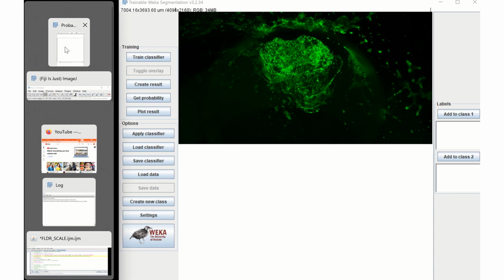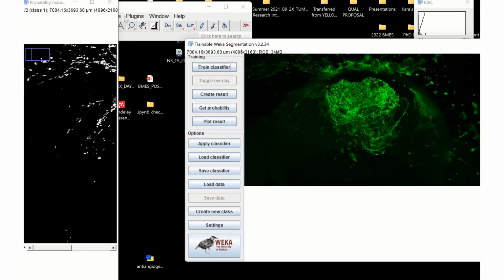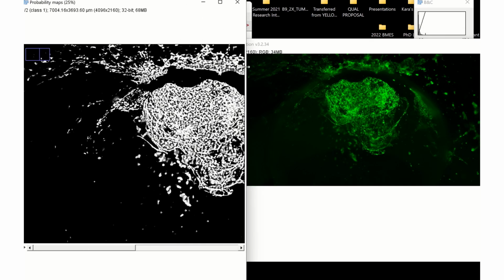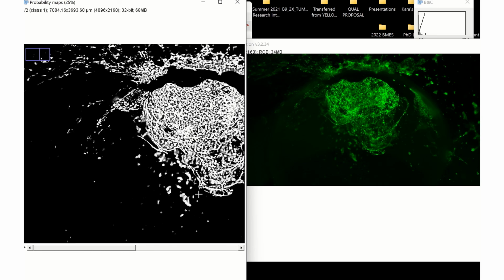I wish I could just get the image. Okay, so this was like not bad. Okay, I don't even know how to. Okay, but it's not bad.